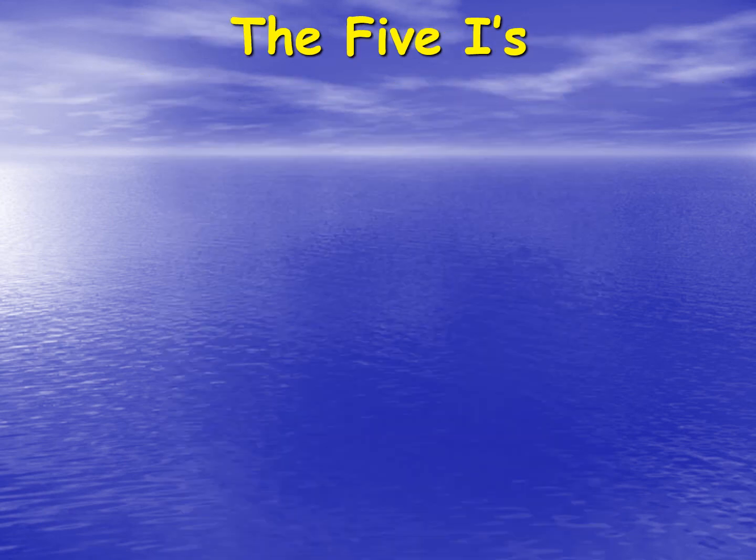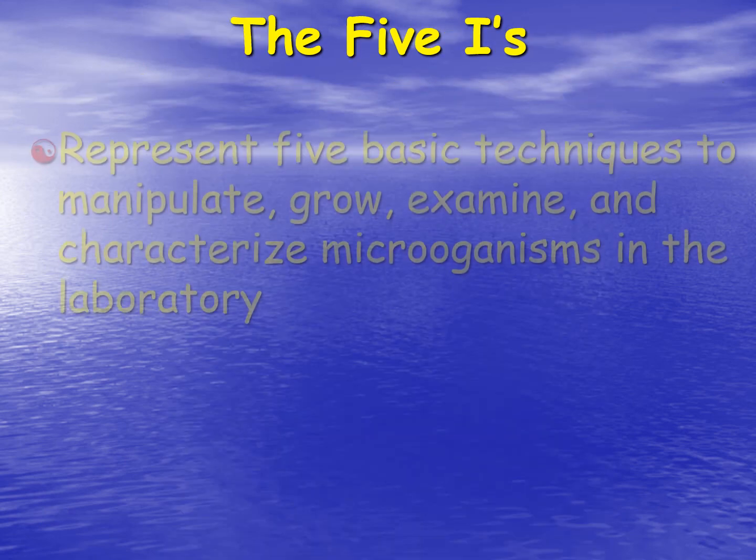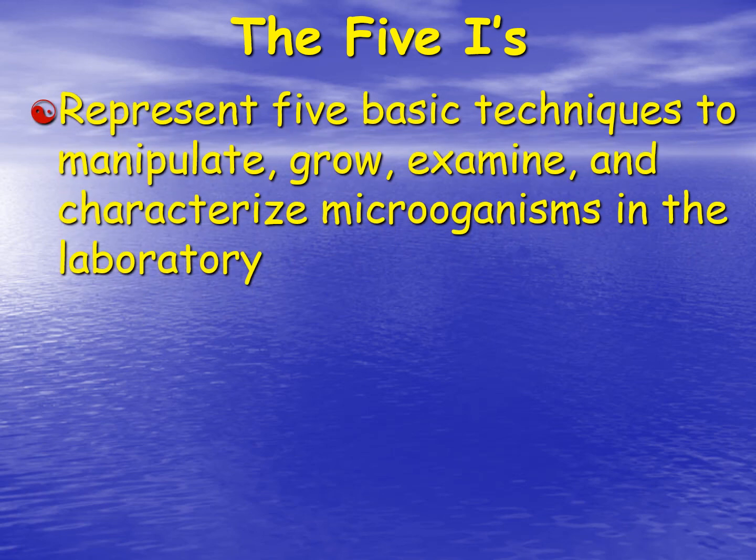First of all, I want to introduce you to the 5 I's. These represent 5 basic techniques to manipulate, grow, examine, and characterize microorganisms in the laboratory. The first I is inoculation. This is the introduction of microbes into a growth media.